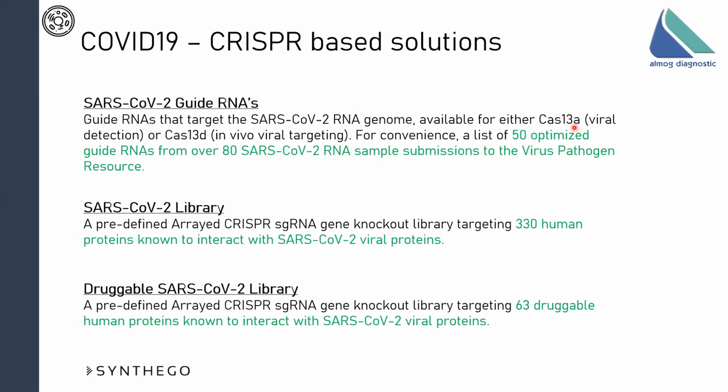Now, the other 2 options you have are SARS-CoV libraries. There are 2 libraries available. One library is of 330 human proteins that were collected from published and known data in the literature as known to interact. Those are human host proteins, and they are known to interact with the virus upon infection.